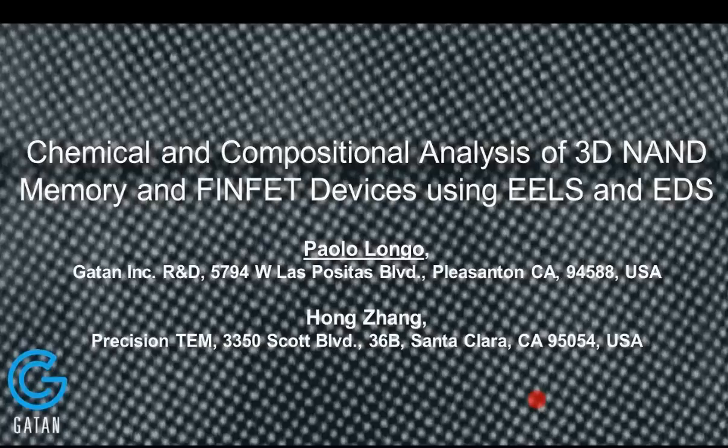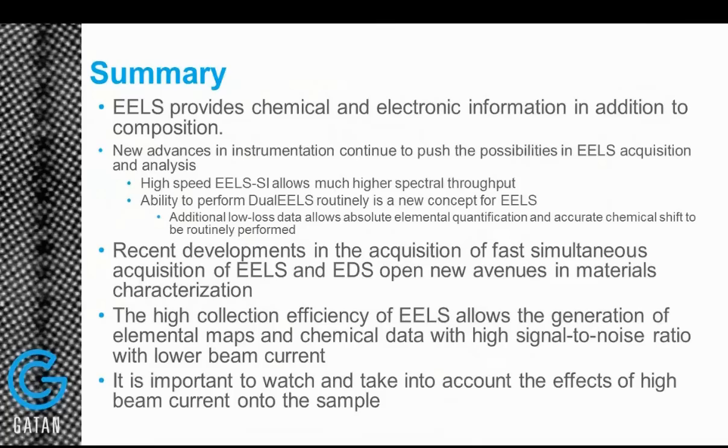Okay, thank you. We had a couple of questions about the chemical analysis, and I'll try to put them all together into a single question. All the energies are really close together for the different silicon phases. So how do you actually set up the analysis for those phases? And also, if you have more than one phase through the thickness of the sample, for instance one type of material on the front surface and a different material on the back surface, does that affect your analysis? Let me go back to the slide here. So we're talking about this, right?